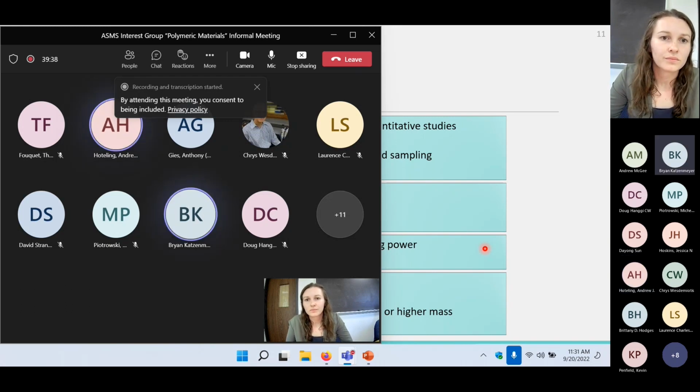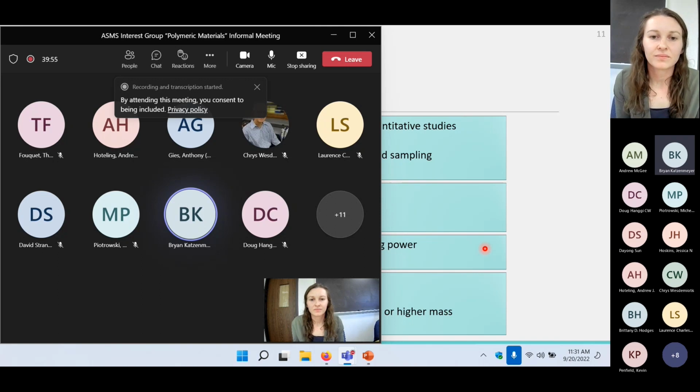Yeah, I was thinking along the same line. I was just curious to see if anyone else felt the same way. I know solvents can be expensive, but with today's columns and in some cases some systems available from the various vendors, you can definitely take advantage of that and run your analysis in less than 10 minutes, which is a typical runtime nowadays. So solvent consumption is not as bad. And you can also get very accurate molecular weight information if you're using detectors like light scattering or viscometry, if people want to get more detailed than just refractive index.